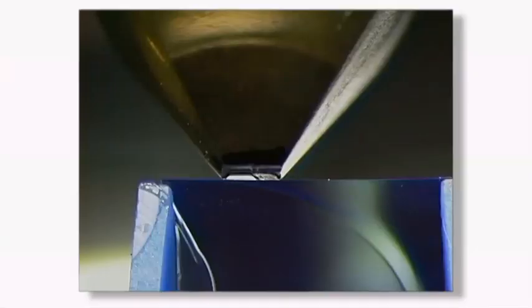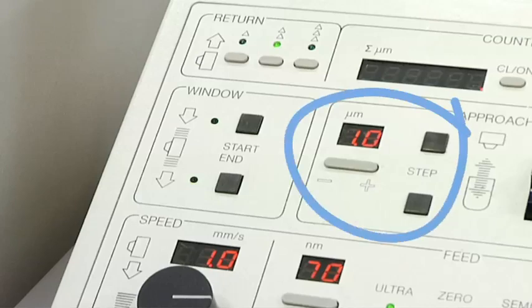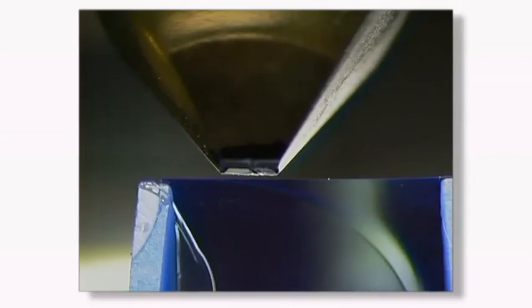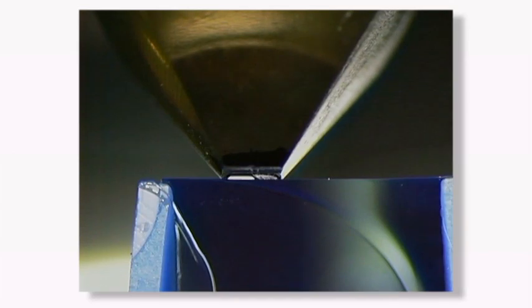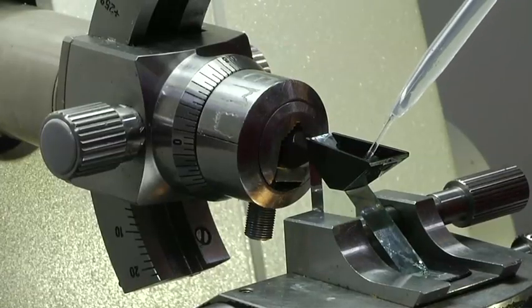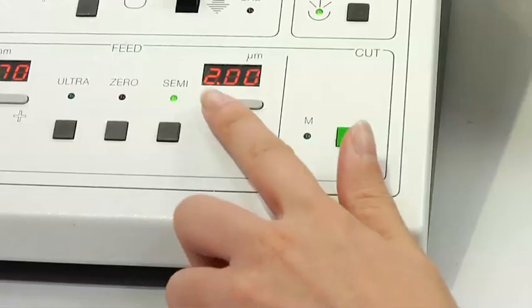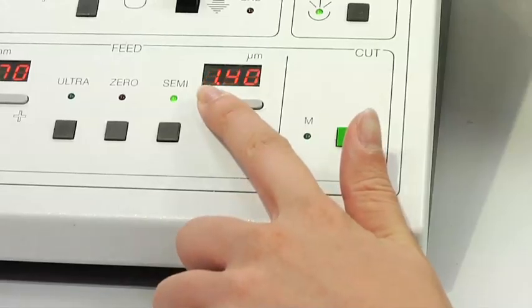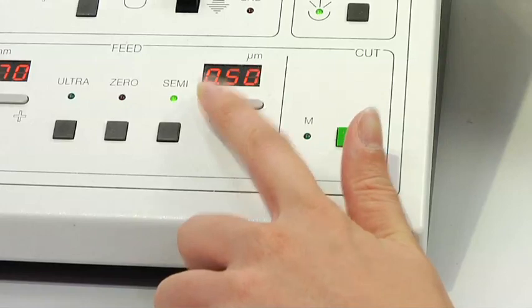If not, adjust it. When a third of the reflection remains, approach using the fine approach in one micrometer increments until the reflection is just about to disappear. Fill up the knife boat with distilled water until the surface of the water presents a silver sheen. The water will support the sections as they come off the knife. Set the feed to half a micrometer and turn the hand wheel until sections are being cut.